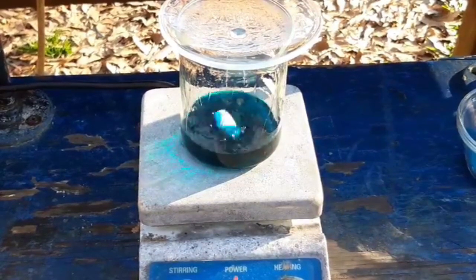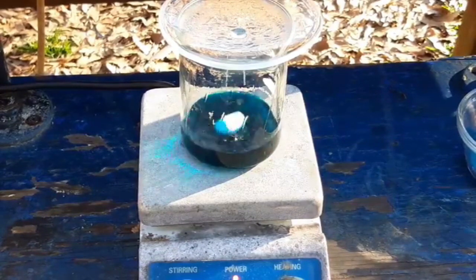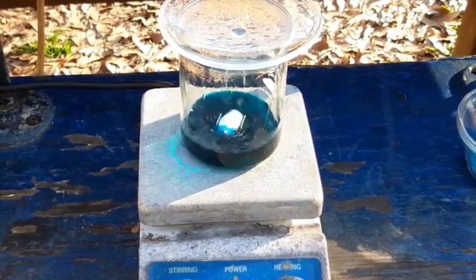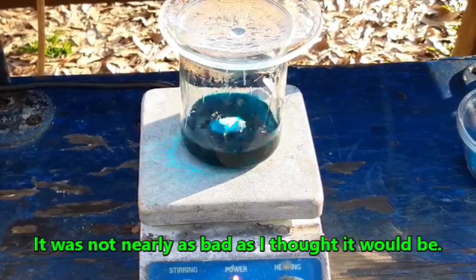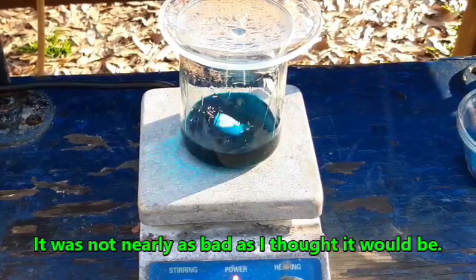My chemistry instincts are telling me that when I add zinc to hot acetic acid, this thing is going to generate a lot of hydrogen. It's going to foam, maybe. I don't know what it's going to do. But I'm thinking it's going to react kind of vigorously with zinc dust. But this is what the paper says to do.